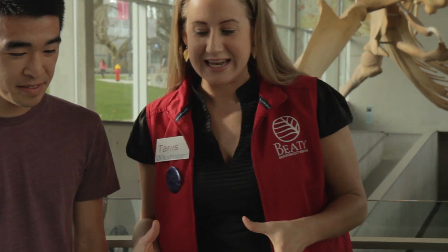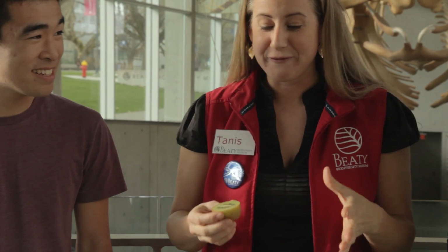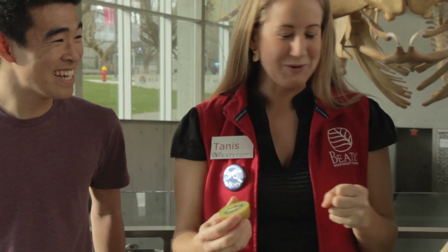Well, first of all, I need your help with this. So we're going to look a little bit closer at DNA today and extract DNA out of this piece of kiwi fruit. So I'll need your help doing the steps. The first step is to actually get the kiwi fruit out and smush it up a little bit. Okay. So who wants to do that?